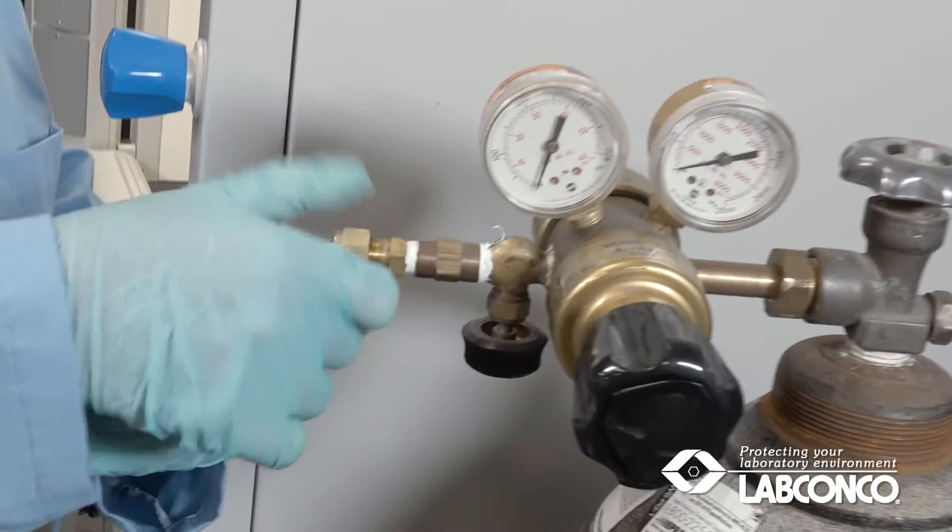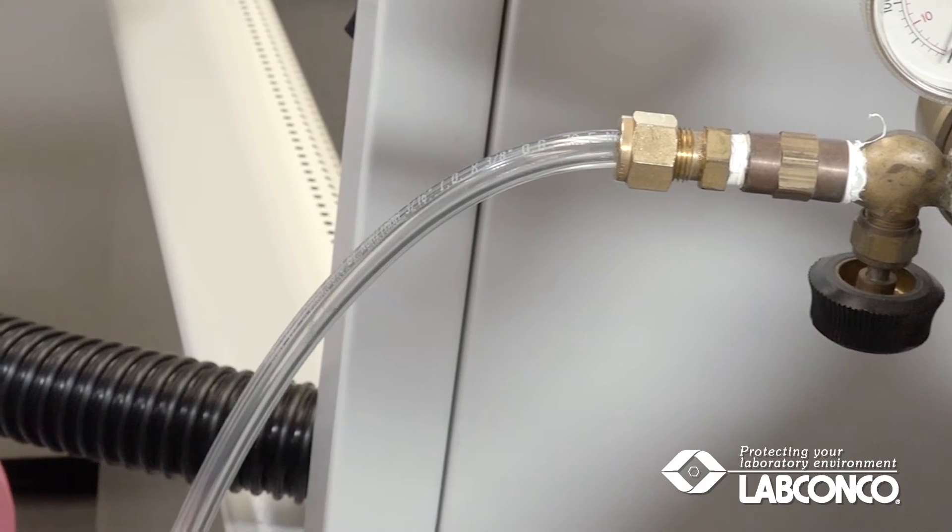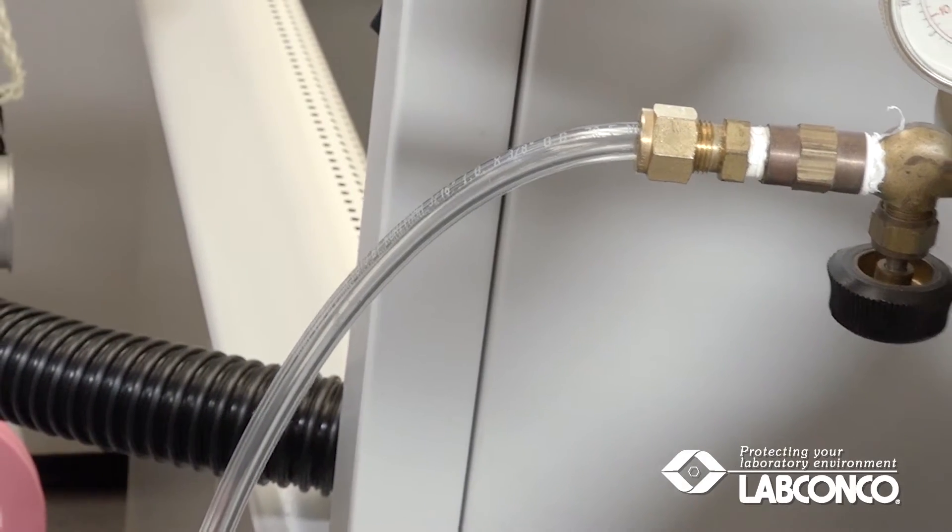Alternately, a compression fitting may be used that is suitable for a hose with a 3/8 inch outside diameter and a 1/4 inch inside diameter.